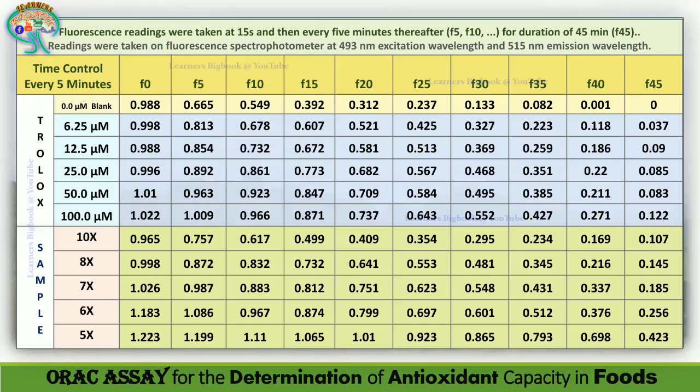Even instead of 5 minutes, you can go for 3 minutes, where you will get more slots to perform. Here we got 9 slots from 5 minutes to 45. If you reduce to 3 minutes, you will get more than 14 or 15 slots.